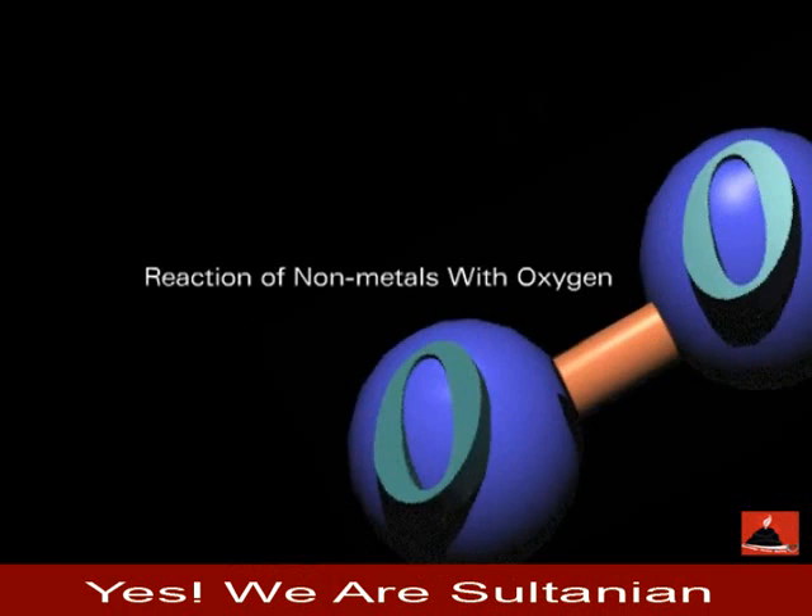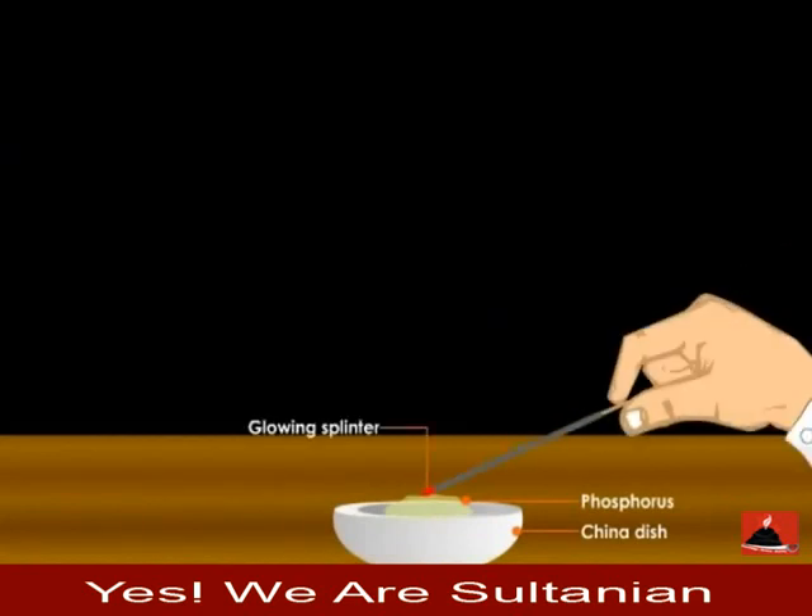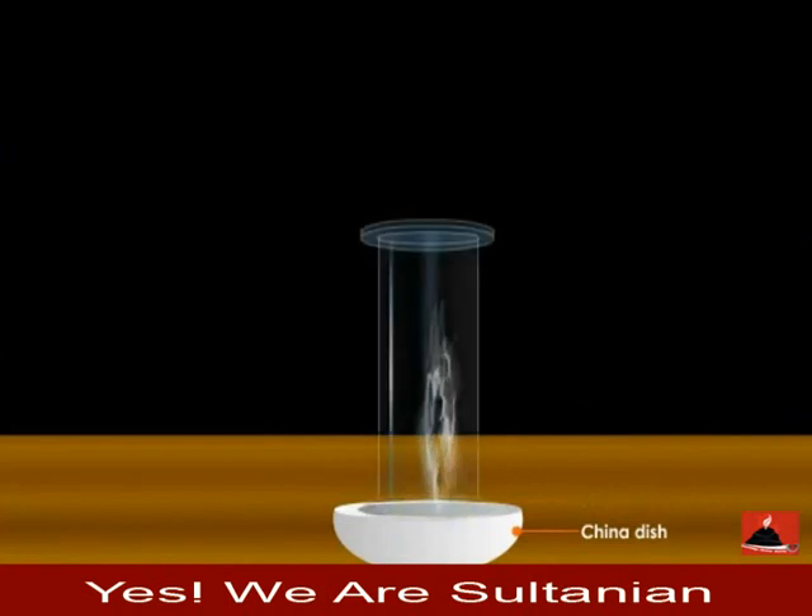Reaction of Non-Metals with Oxygen. Place a small piece of phosphorus on a china dish. Burn the phosphorus with the help of a glowing splinter. Cover it with an inverted gas jar.